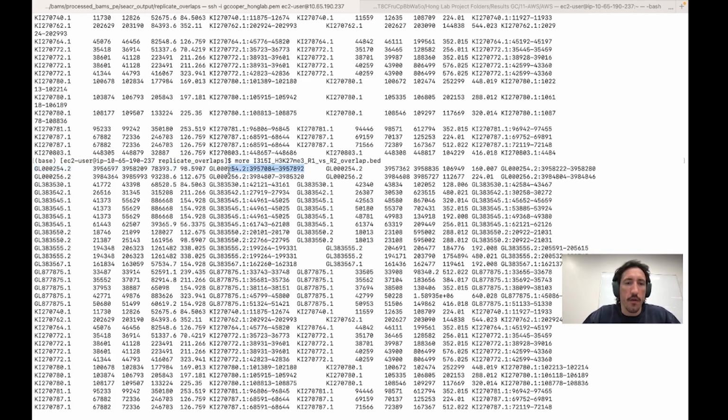We have all the information for rep1 and all the information for rep2. We don't really need this. All we really care about are the genomic regions that are present in both peaks. You can't really average the two signals together. That's not something that you typically would do. So we're just going to extract specific columns from these rep1 versus rep2 bed files, and that will ultimately give us our final consensus set of peaks.